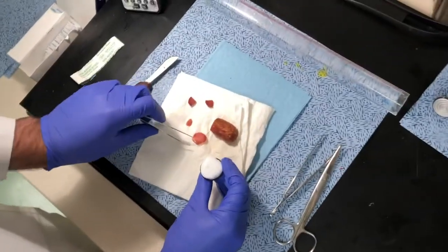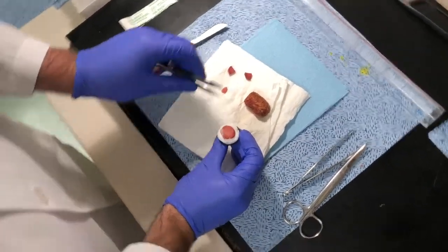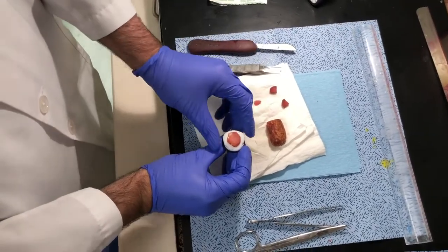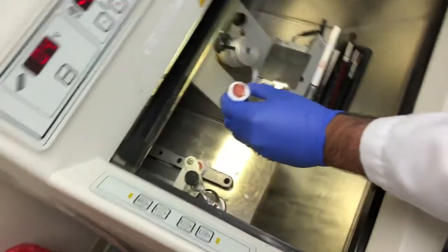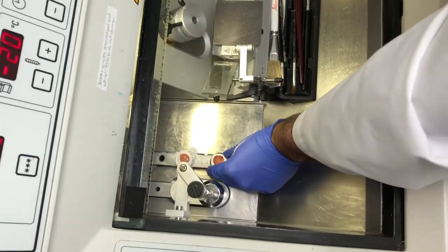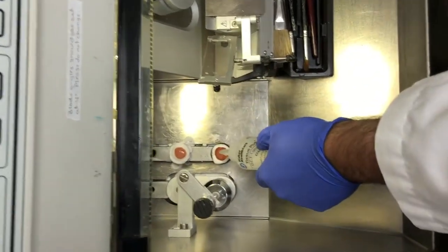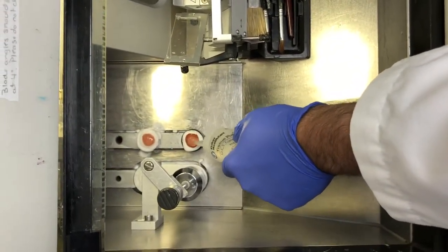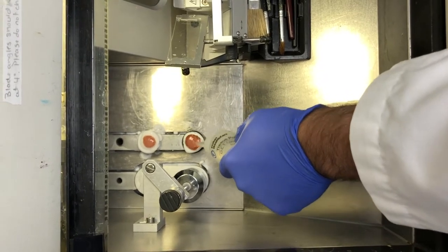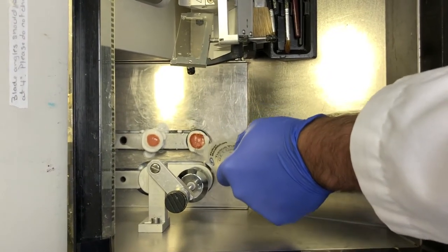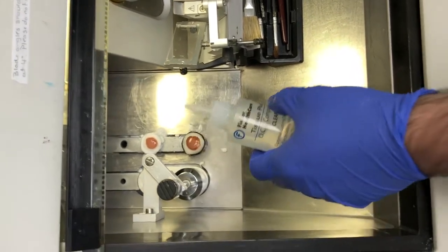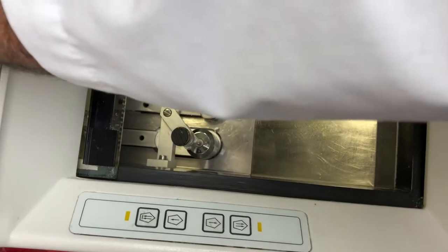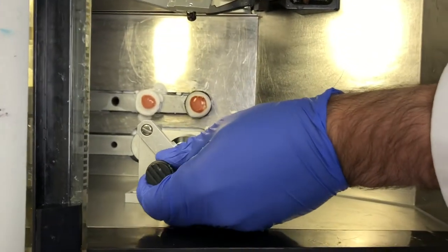Put the specimen onto the chuck. Add another layer of the OCT compound. Put the freezing block on top of the chuck to help it cool quicker.